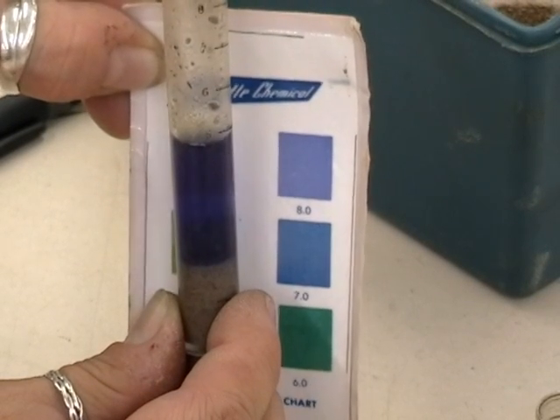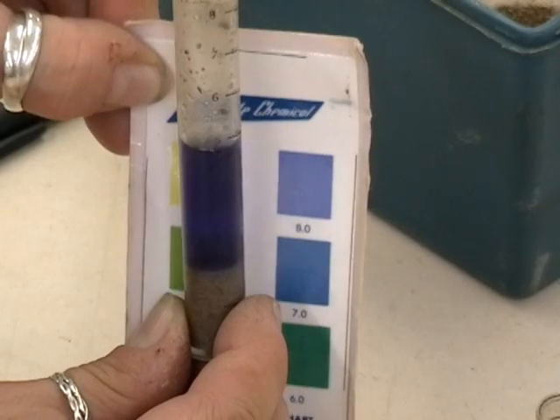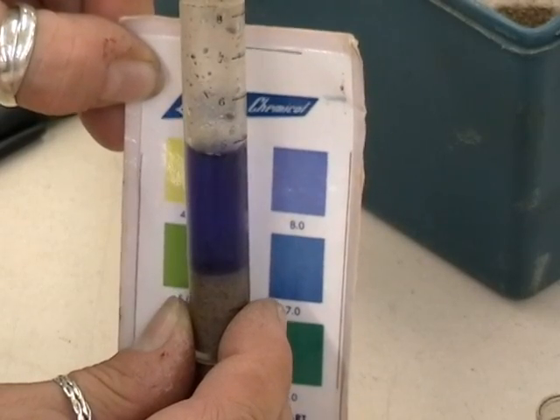As you can see, this particular development of colour is closer to the purple than it is to the blue. So in this case, we'd probably call that a pH of eight.